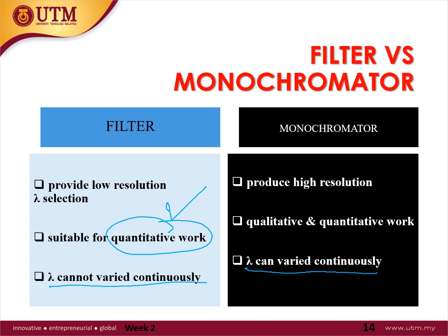Whereas a monochromator in a spectrophotometer will enable you to do qualitative analysis because it scans the whole wavelength from the light source. Whereas for a filter, you are using the filter in a photometer. So when I give you a test or quiz, and I say UV VIS photometer or UV VIS spectrophotometer, you can now differentiate the two of them.